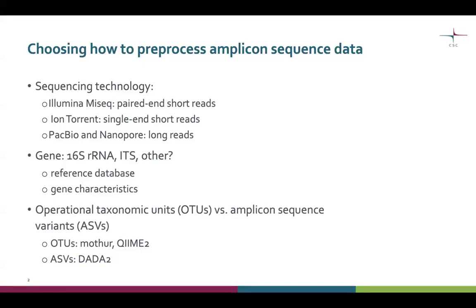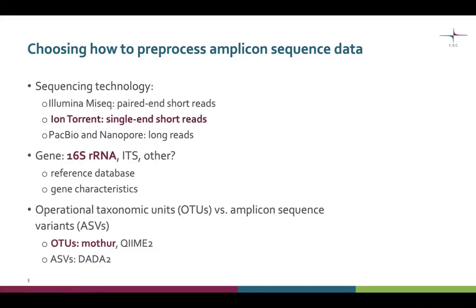In Chipster, for OTUs we have tools available based on mothur, and we have tools available for ASV analysis based on the DADA2 pipeline. In this video, we will focus on a case where we have single and short reads from ion torrent sequencing. We have sequenced the bacterial 16S ribosomal RNA gene and we want to look at operational taxonomic units and do the analysis with tools based on mothur.